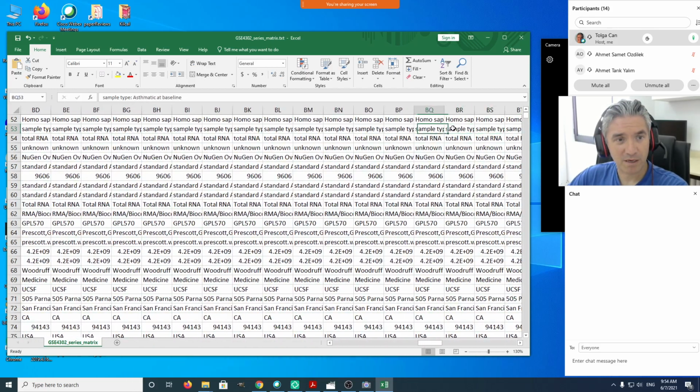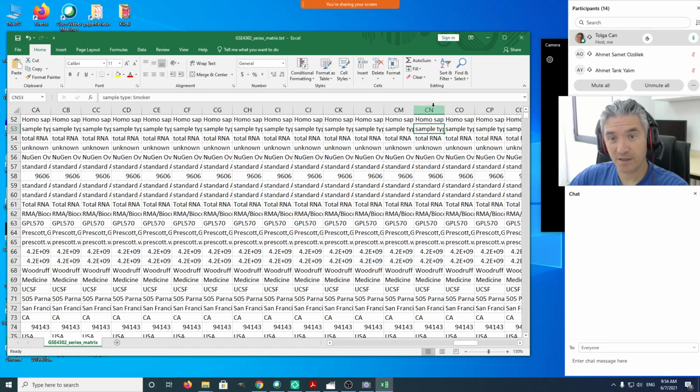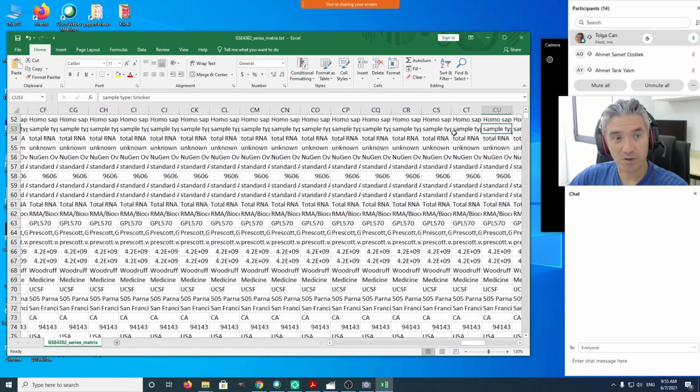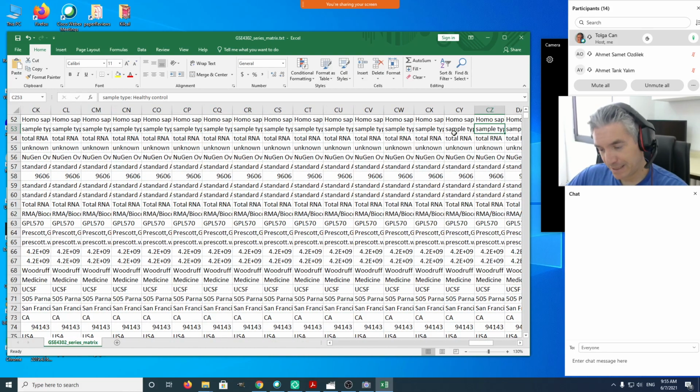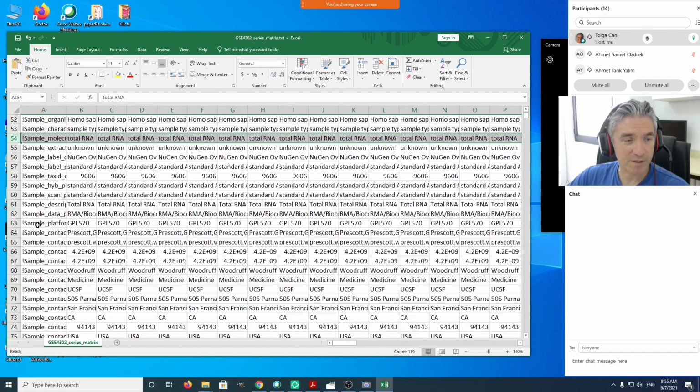and you have healthy controls. So this column corresponds to a healthy control, and we should also have smokers. Yes, and this column corresponds to a smoker. This column corresponds to another smoker. As you can see, each of these samples has some labels. They belong to smoker, asthmatic, baseline, after Fluvent, after placebo. So this 53rd row is something that is important for us. Let's keep that.